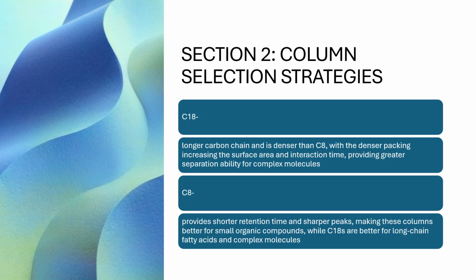Think of it this way. If you want more retention and greater separation for a complex mixture, use C18. If your peaks are too broad or retention is too strong, switch to C8 for faster elution and sharper peaks.